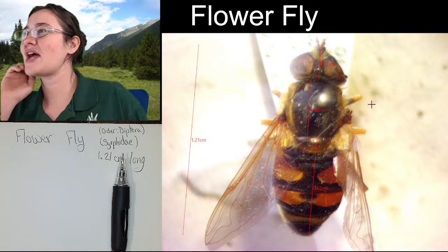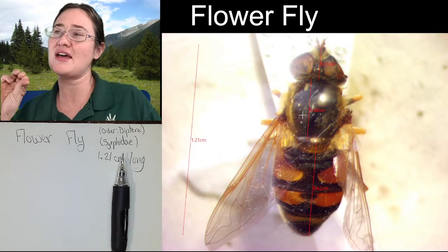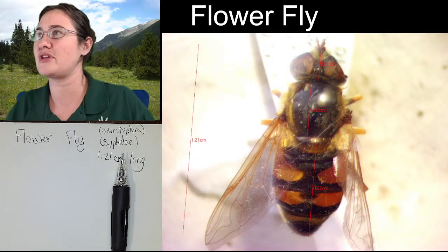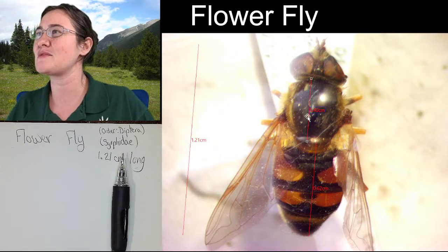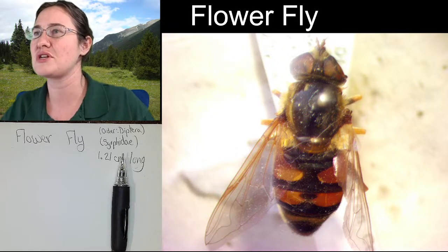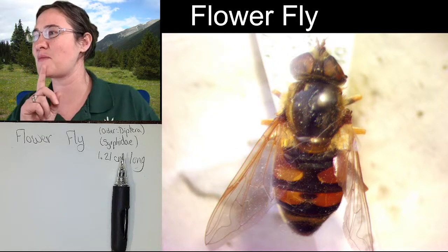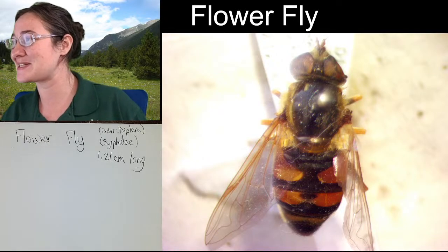To give you an idea, it looks like the length of the head and the thorax is equivalent to the length of the abdomen. And I think that some of us really appreciate having some of those numbers for our ratios. So that might be able to help you out. It is looking good for its age.